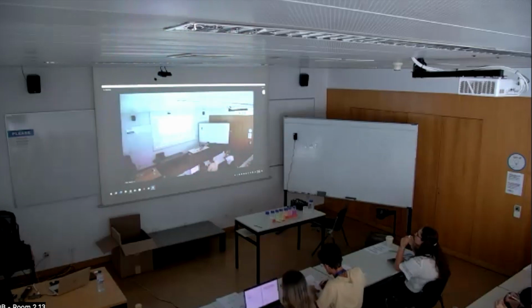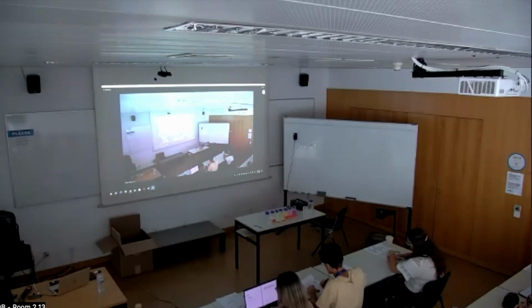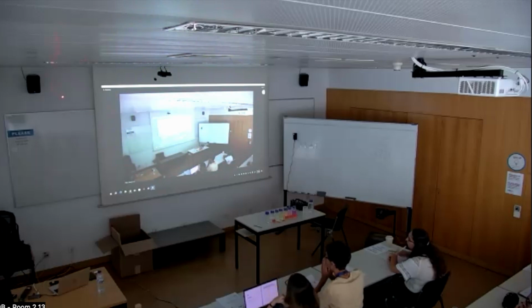You will understand it. Now let's try to change wavelength because there is a second observation to be made. So the first observation, what was it? Smaller features, larger diffraction pattern. Larger features, smaller diffraction pattern. Now let's observe the very same wire with two different wavelengths. So I'm using the thinner wire, which doesn't really matter.